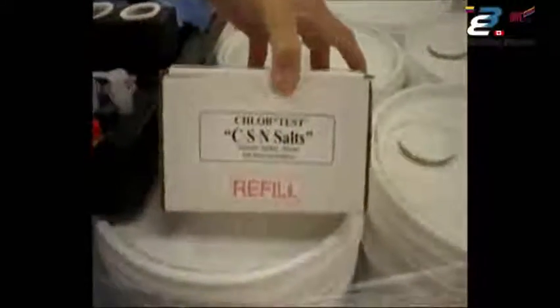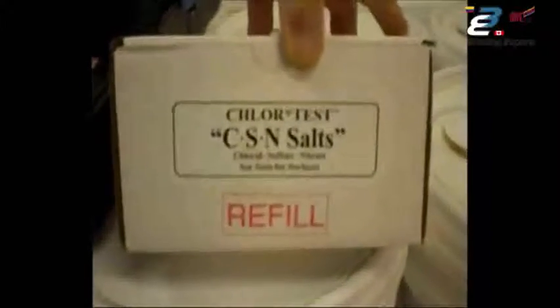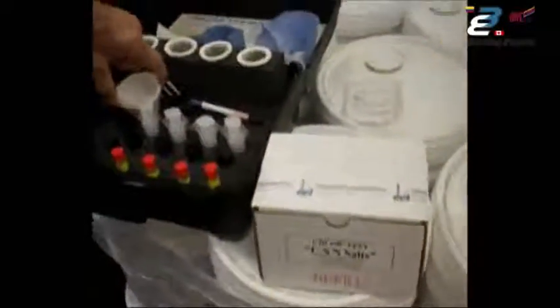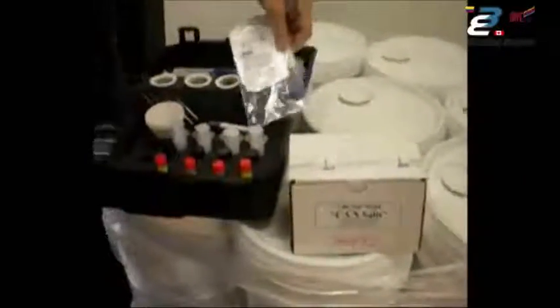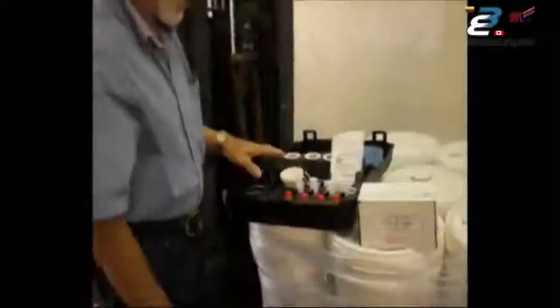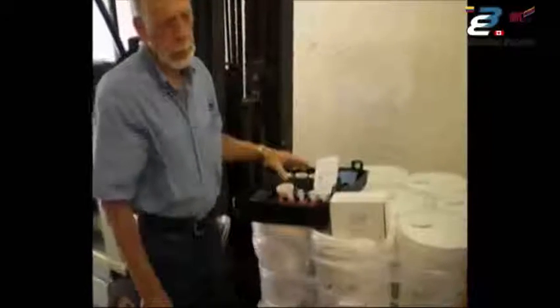That's how simple and easy it is to do the test — all you have to do now is record the results. Once you've used everything in the test kit, we provide a refill kit — the CSN Salts refill — which includes everything in the case other than the meter itself: 5 adhesive sleeves, 5 titration tubes, 5 funnels, a new snapper, filters, extract, reagent, and nitrate test strips — basically 5 of everything to refill the kit. It's also available in a bulk pack refill of 50 of each component, with a cost savings of about 10% for larger jobs.